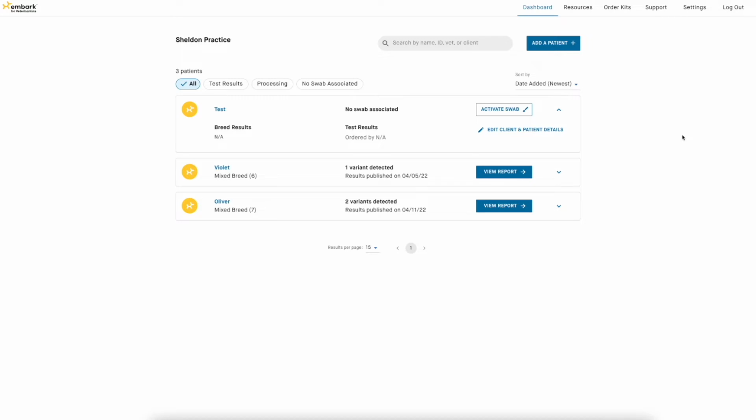And I just want to take a moment to walk you through the dashboard, show you how to use it, how to log new patients, activate swabs, and some of the additional resources that are available to you in here.